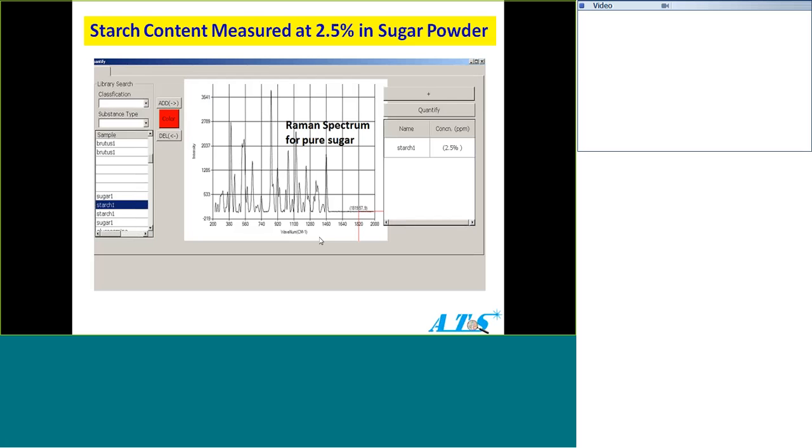Yes, we have the folder with all the methods of the producer for qualification. Because in the QC department, we go through the wavelength calibration, which is documented, we call ATP, acceptance test procedures. They have to follow the guideline, the SOP methods, and we also test that 96-well plate to make sure they are reproducible from well number 1 to well number 96. That's the instrument we sent to the Pittsburgh conference in New Orleans on March 4th, and that's the test data they gave us.